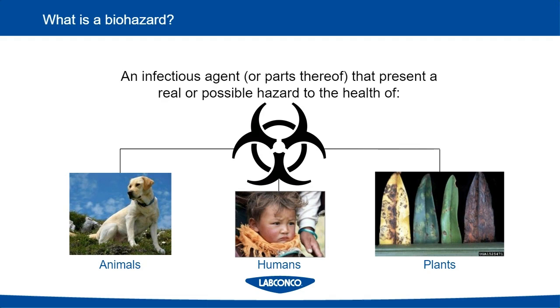In a very general sense, a biohazard is any kind of virus, bacteria, or particulate that can affect plant, animal, or human life in any way. So these, again, could be viruses such as the flu viruses, which can affect several animals and humans as well, versus plant viruses that could be detrimental to various plant life. Any of these types of hazards we need to be very careful with when we're handling them, because exposure to them or release of them into the environment can be detrimental.